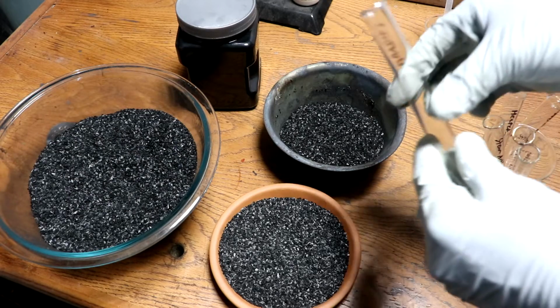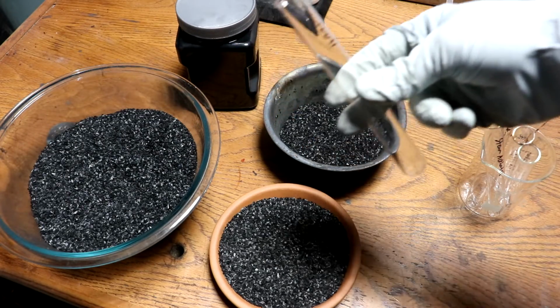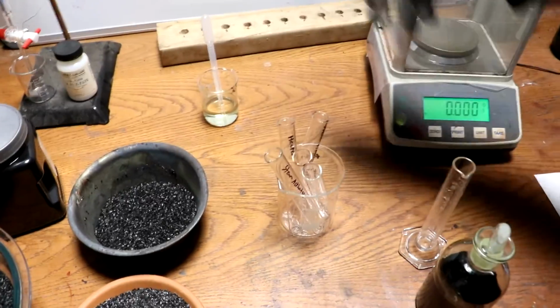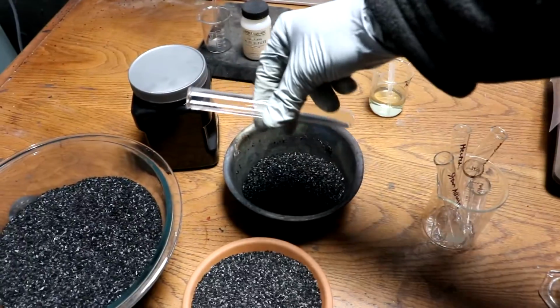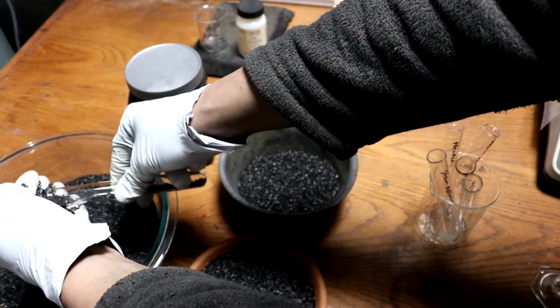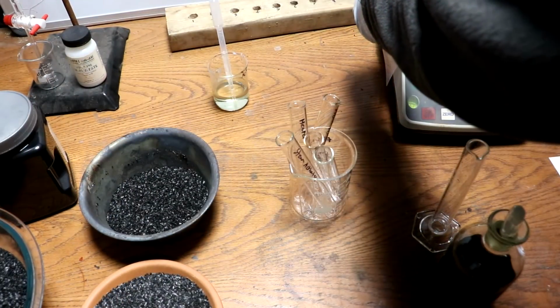So what I'm going to do is take a test tube, which I have labeled, kind of hard to see, and I am going to put the test tube on a scale to measure the weight of the test tube, tear that away. I'm going to attempt to put in about a gram of the charcoal. So this is the control, which hasn't had anything done to it.